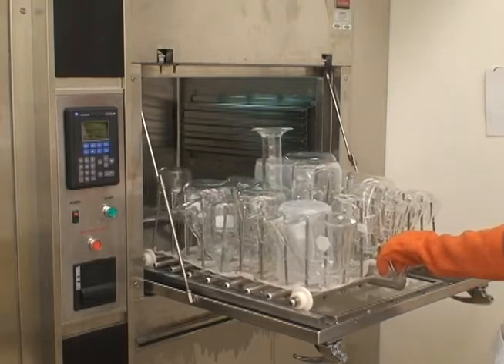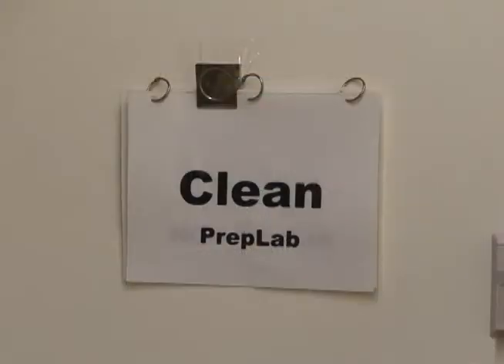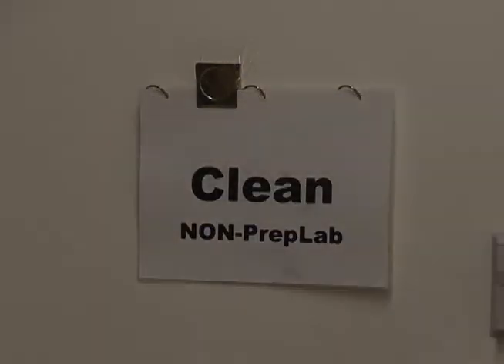Wait a while for the dishes to dry off and cool down a bit, and then you can unload. In the case that you use the same dishwasher for multiple labs, you should have a system to indicate what goes where. For example, we use a sign that can be flipped to either prep or non-prep labs.